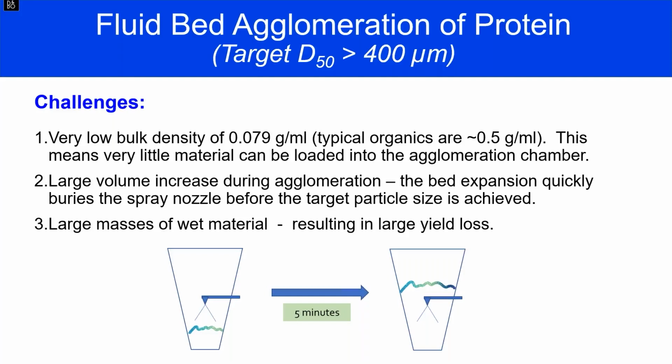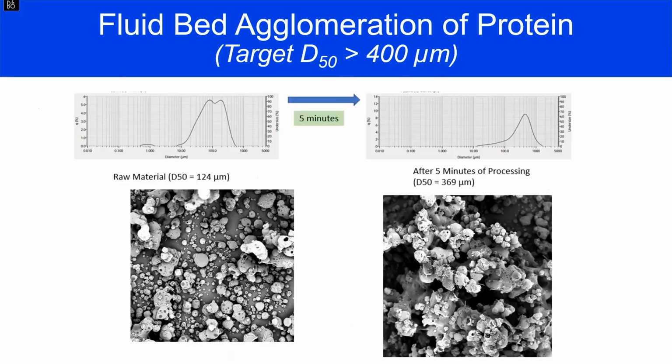And we were able to get some powders out, because I'm going to show them to you in a second, but it wasn't an easy process to look at. So let's just take a look at what this looked like. The starting material was a little bit bigger than we normally get, and you can see it is a spray dried material. And if you look closely at it, the structure of the particles here will really indicate that these are hollow, which would help explain the low density that we started with.